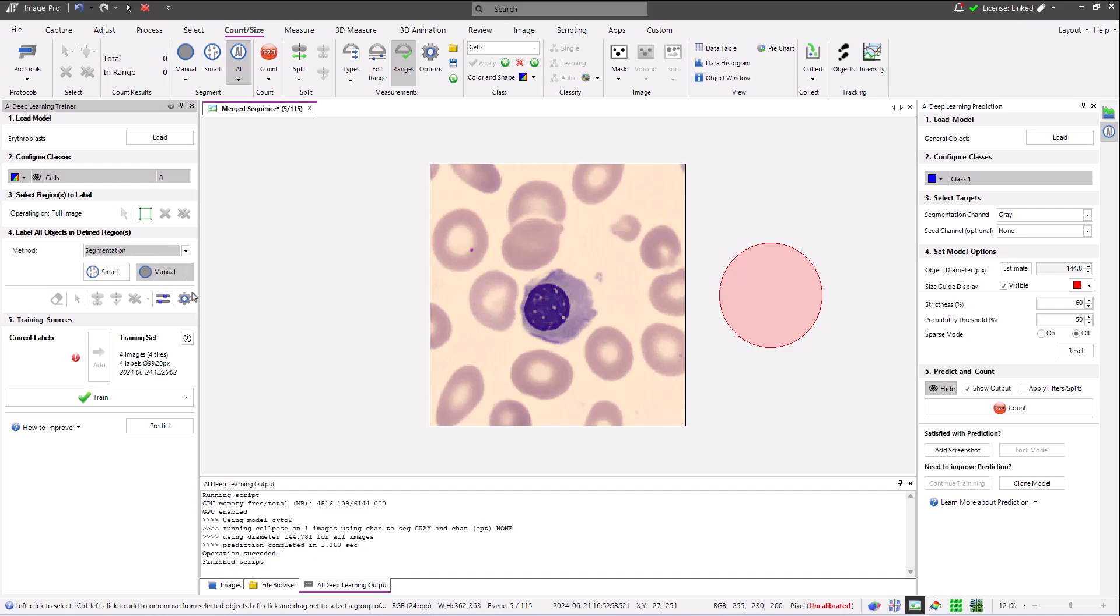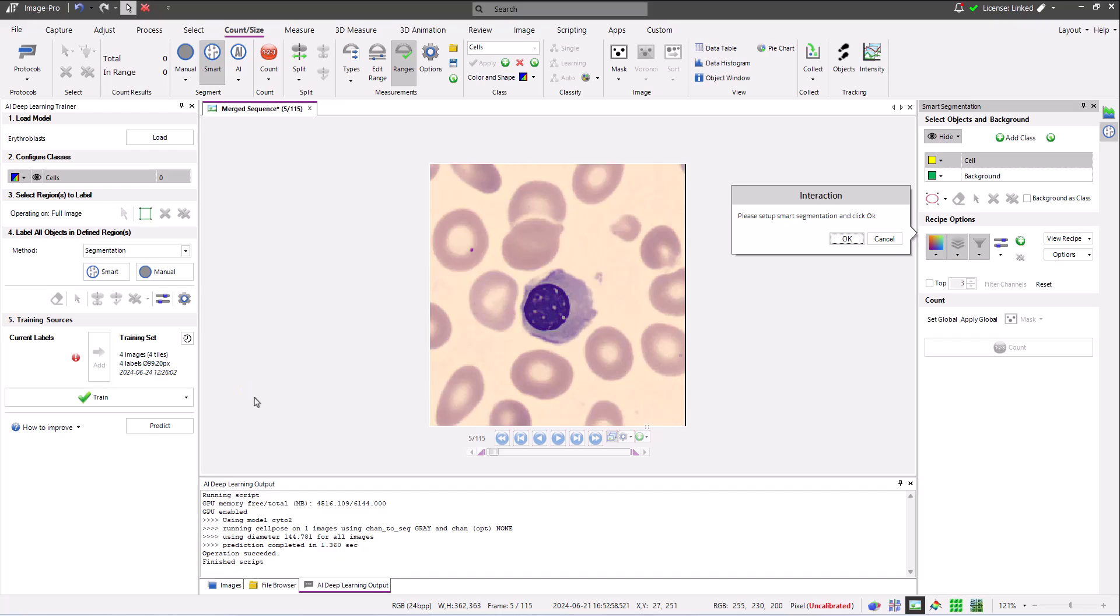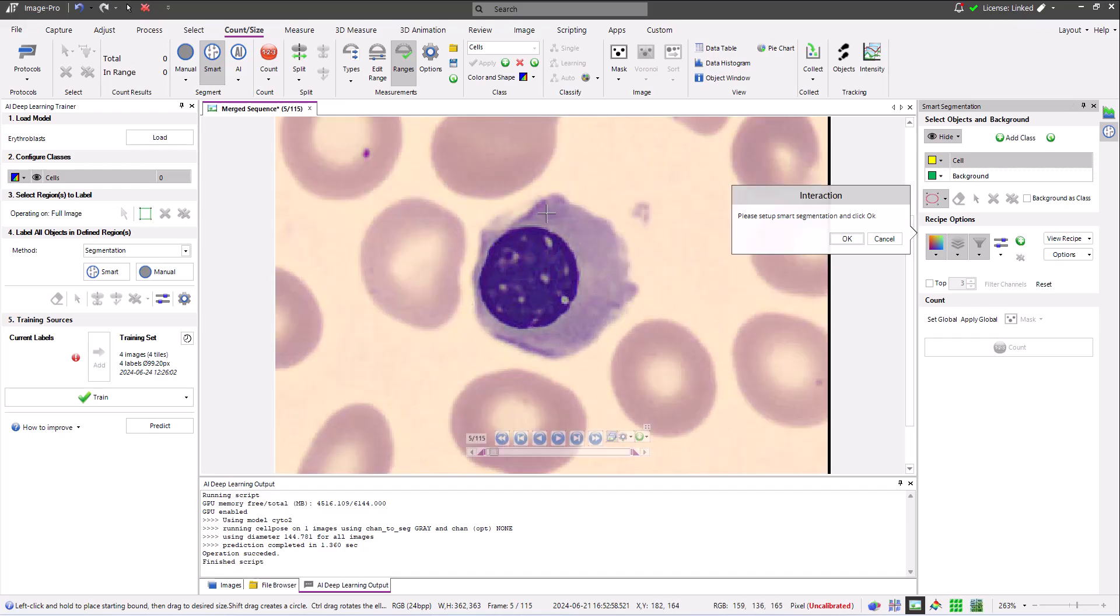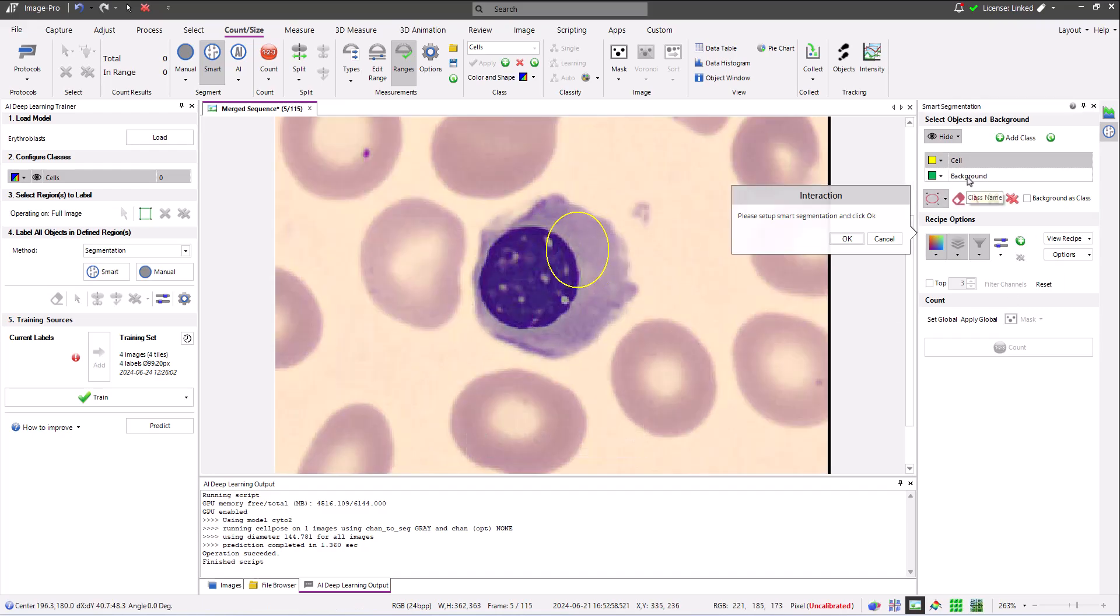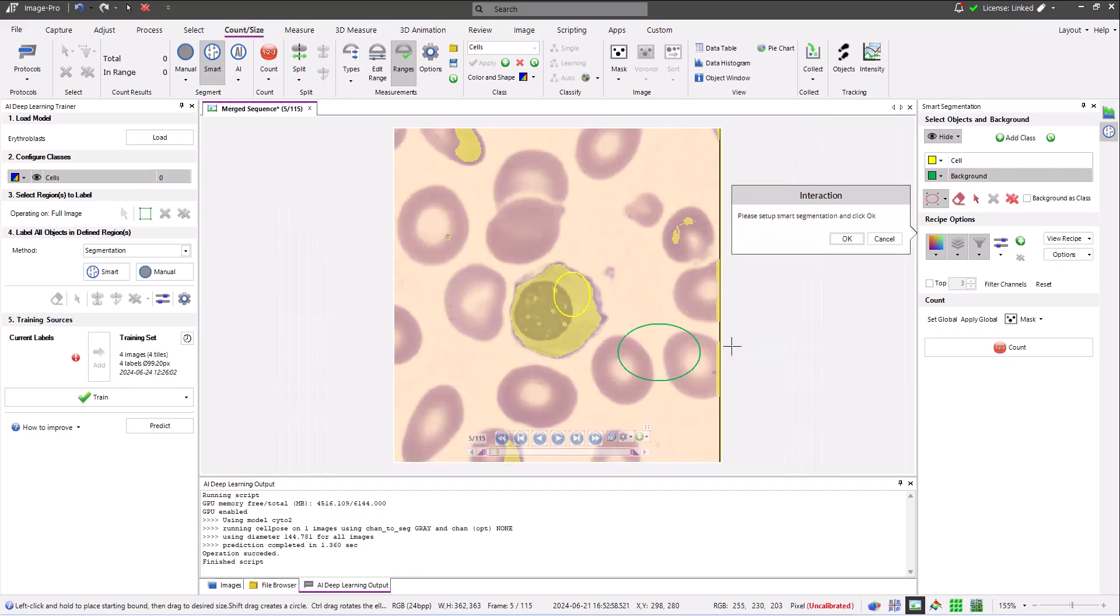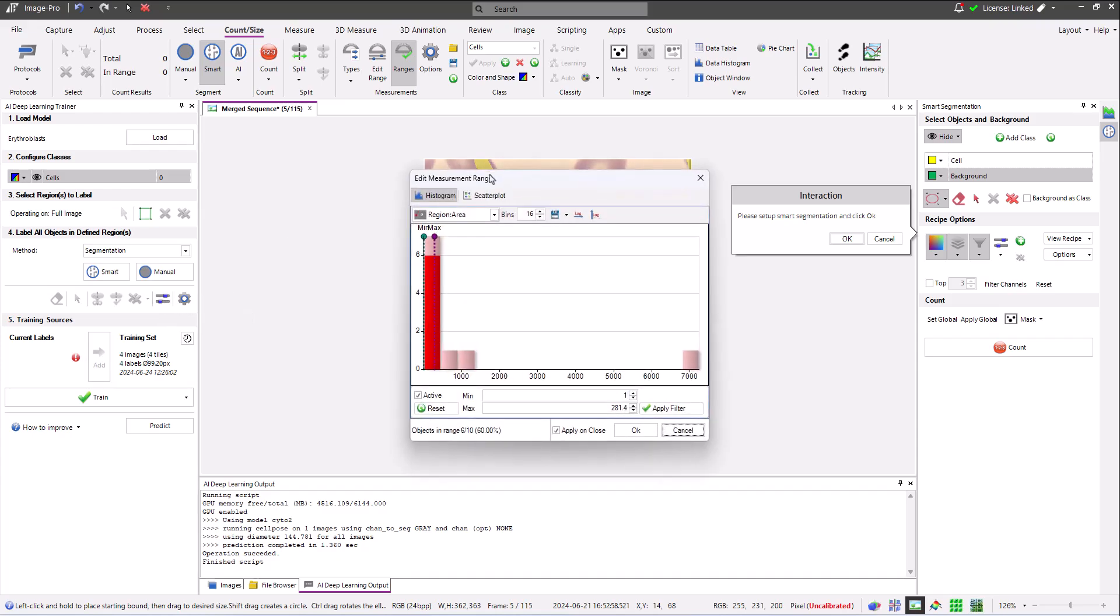Similarly, when I select the Segmentation option, I can choose to open either the Threshold or Smart Segmentation panels. Here I am selecting the Smart Segmentation panel. I build a recipe to find my erythrocyte, and with the correct filtering options, find just my erythrocyte and add the label to my training data.